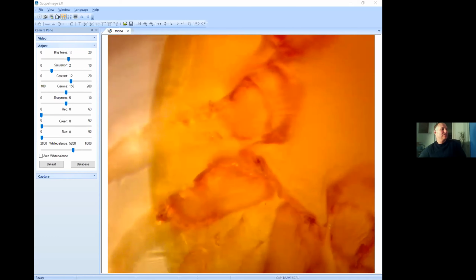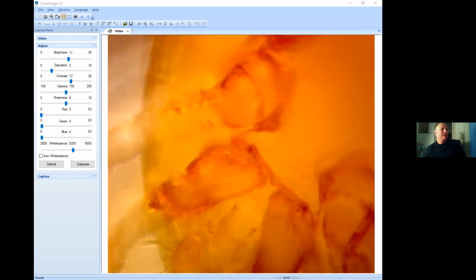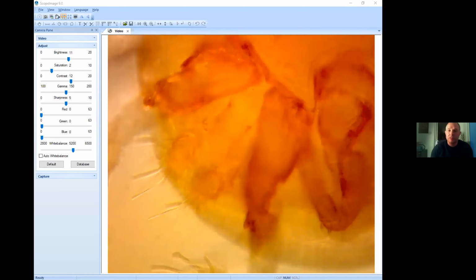Yeah. So it is very much worth getting a good strong top light that you can use to illuminate the features. Most of the old mite books will tell you that what you need to do to identify anything is to soak it in lactic acid on a hot plate for a few hours and then mount it. The problem with doing that is A, it's a hassle, B, not everybody can get hold of lactic acid, not everybody has a hot plate, and it also to some extent gets rid of certain features as well.